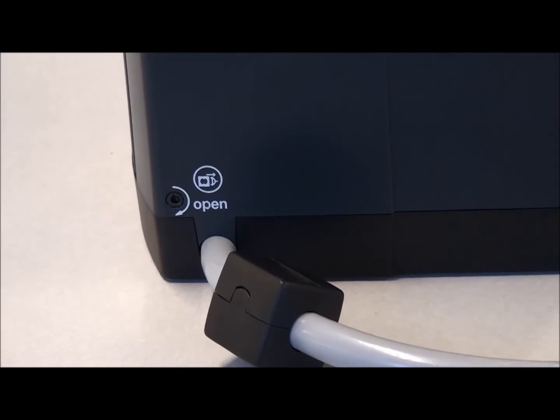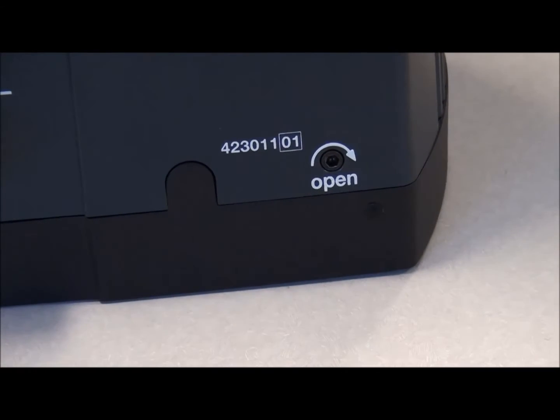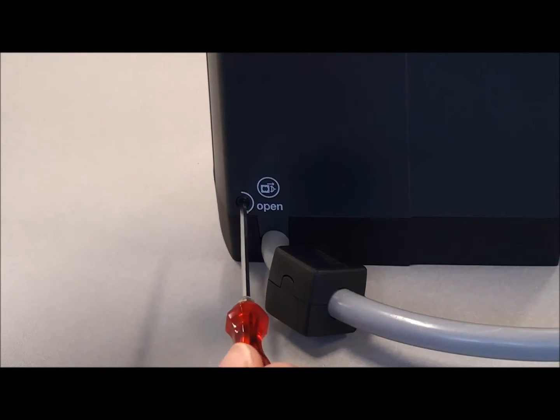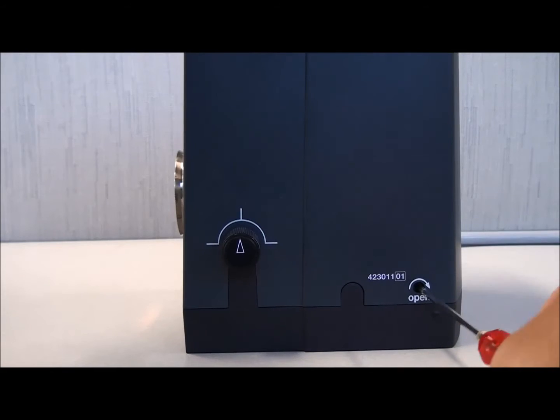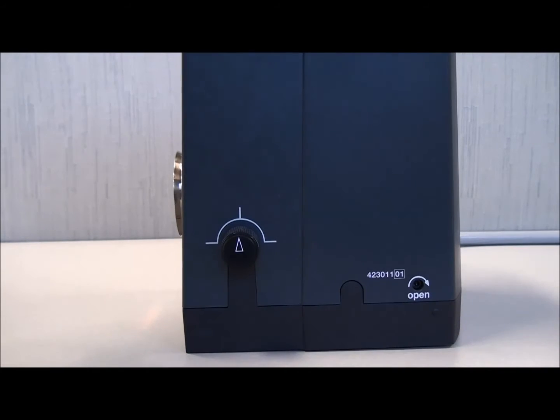There is a 3mm screw on each side of the lamp housing which must be turned in the direction indicated for open. Turn these screws fully until they stop. The cover can then be lifted straight up.